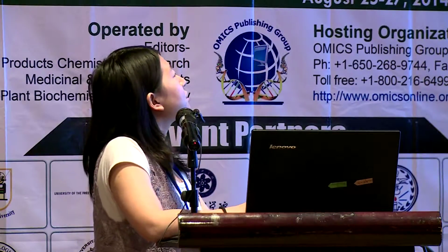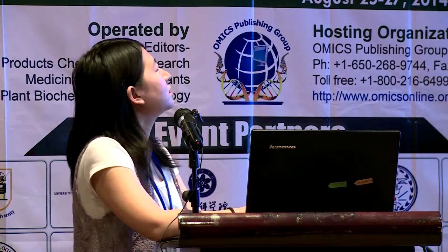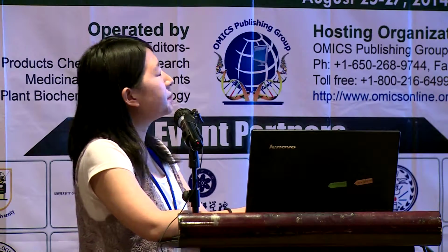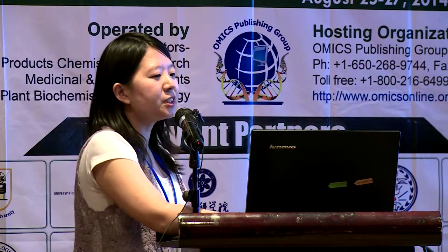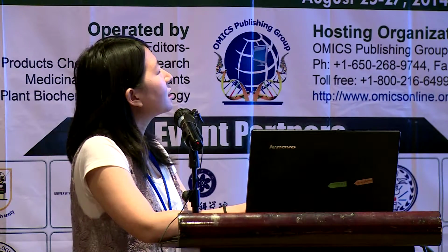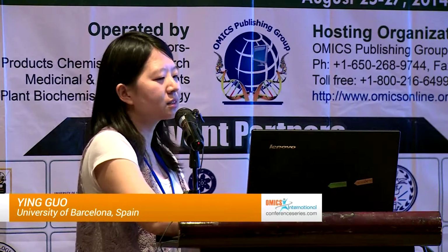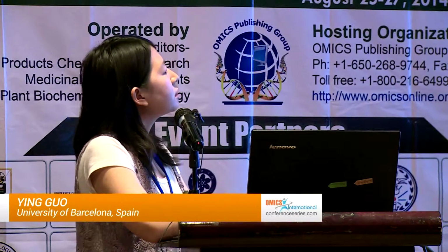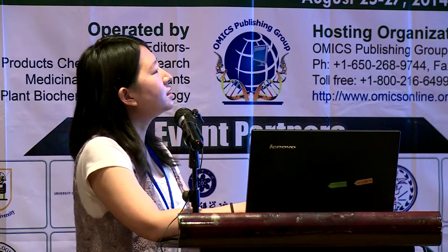Then we extract the alkaloids from the species of Lycoris. I collected 9 species of Lycoris and 1 hybrid. It needs just 50 milligrams of dry bulbs, and we also add codeine as the internal standard. First we extract and then purify, get the purified alkaloid extract, and then put it directly into the GC analysis.